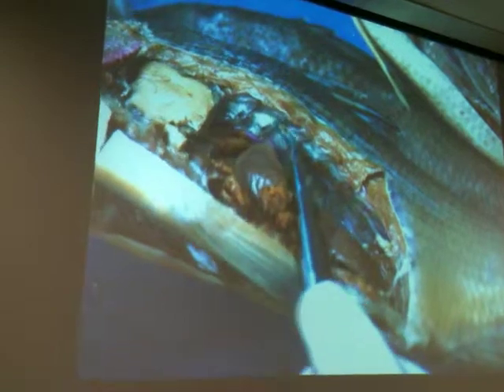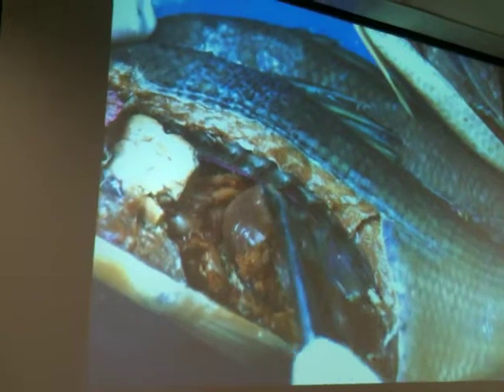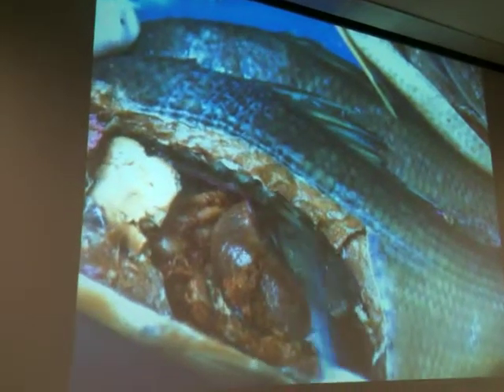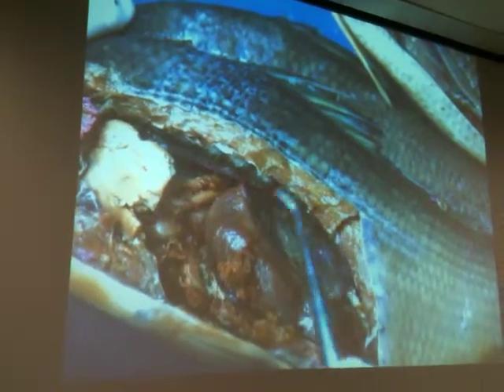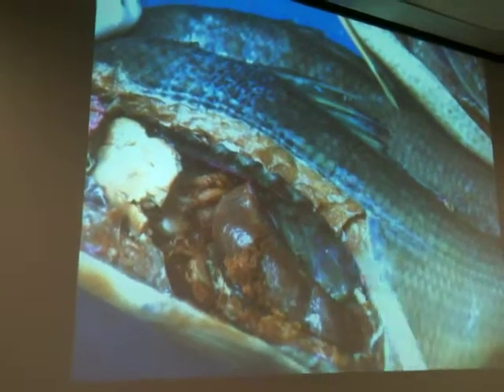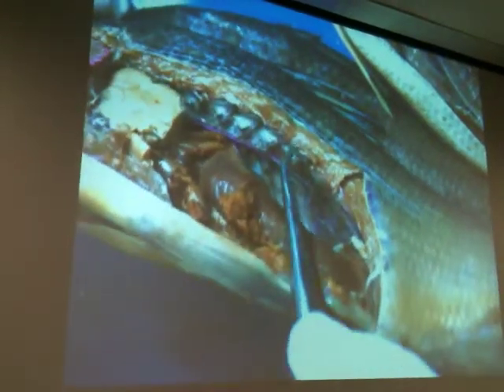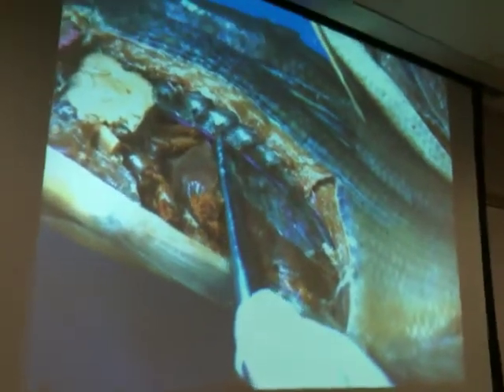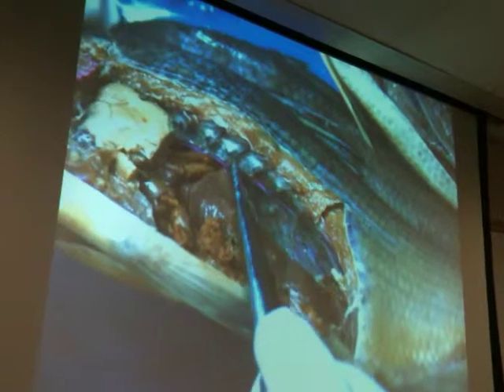So along the vertebrae area over here, in this general region, you might have cut through a clear sac, and that's the gas bladder. Okay, the gas bladder is up here. So in the practical, we might pierce a pin through that clear sac and ask what that is, and we're referring to the gas bladder. There are also dark spots. The reflection makes it so you can't see it too well, but there are dark spots in here, and that's all part of the kidney.